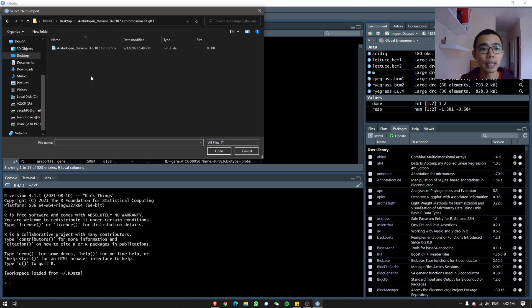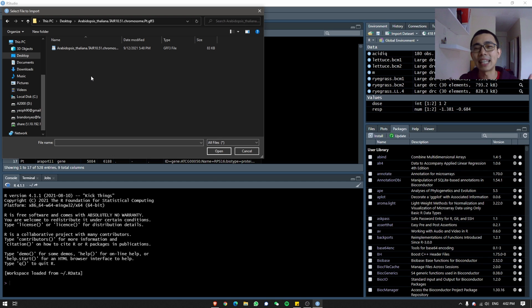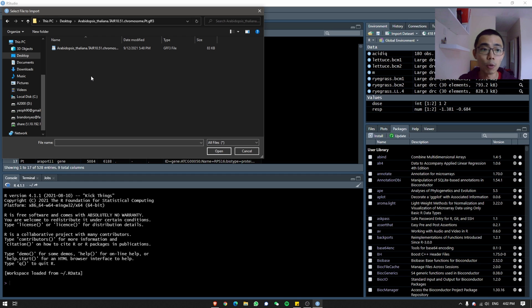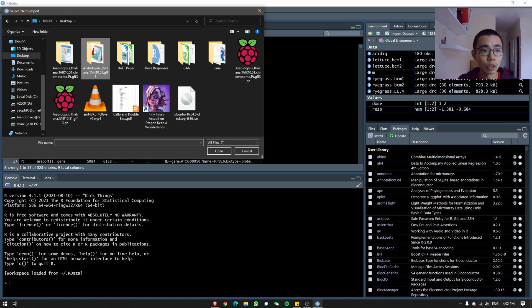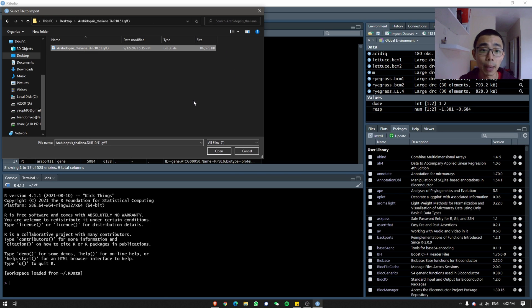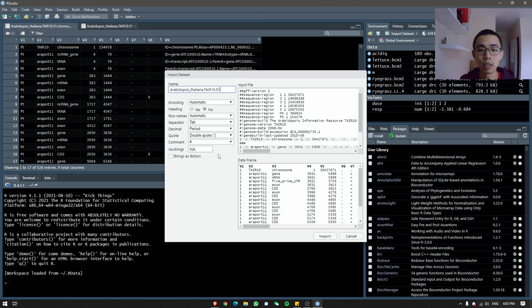So usually when you download, it comes into a tar.gz file. That's just compressed, you can think of it as a zip file. So what you do is you can download a program, for example, 7-zip. If not, I believe Windows can open it as well and just drag it out into a folder. And within that folder, it should contain your GFF3 file over here. This is 107 megabytes. It's a bit big, but it should be manageable for R. So you can just press open.